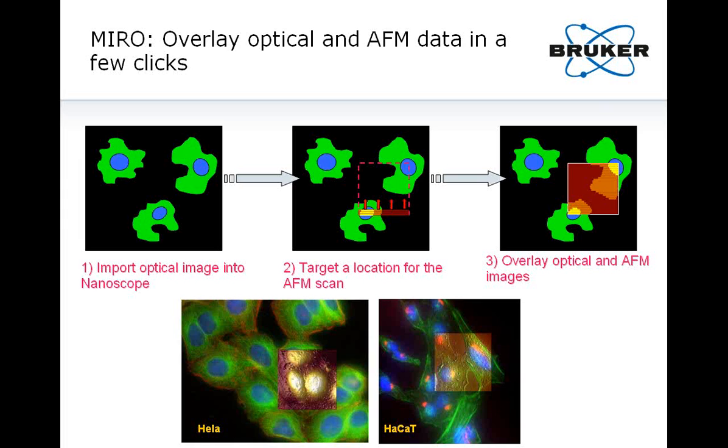You import an optical image, most of the time a nice fluorescence image, inside the AFM software, and use the mouse pointer to define the location where to make the AFM image. The sample will automatically be moved to the desired location, and the AFM image is captured and fully integrated inside the optical image.